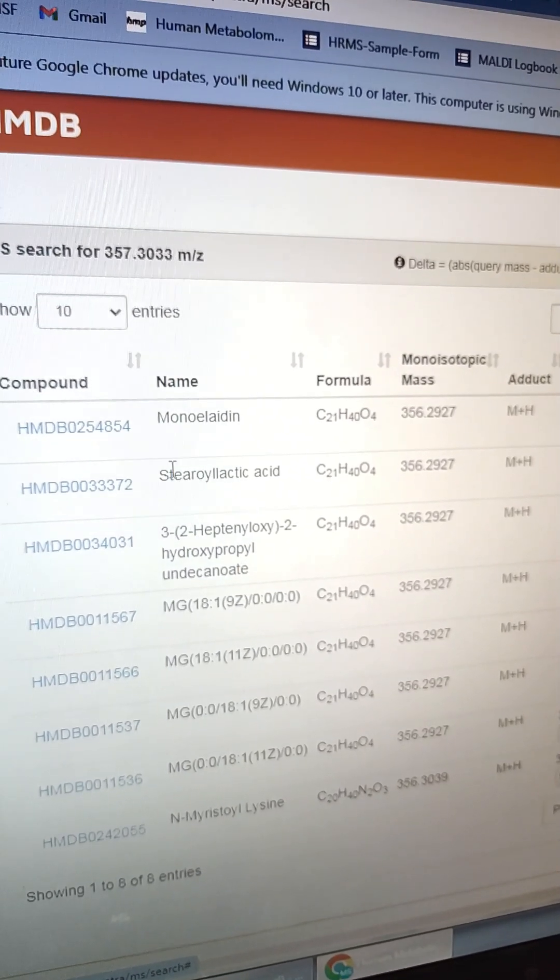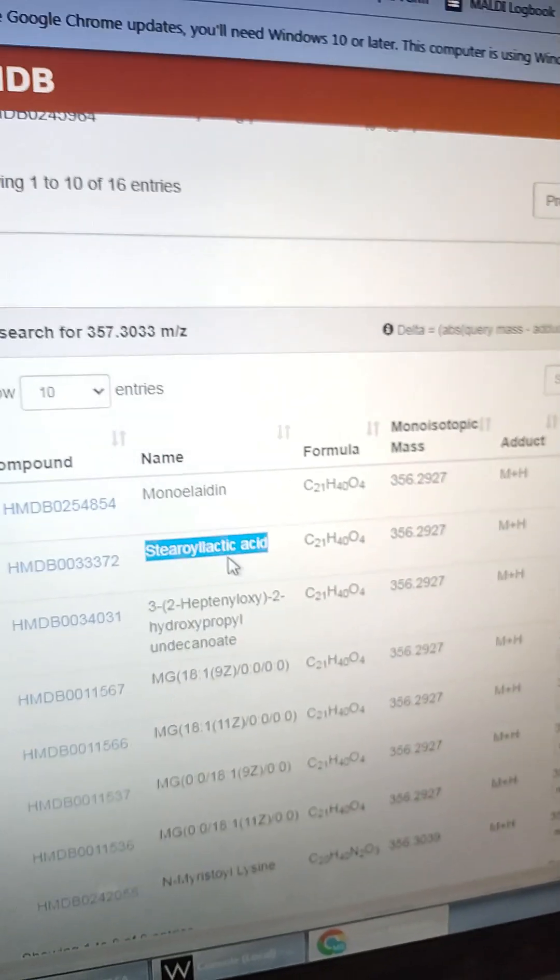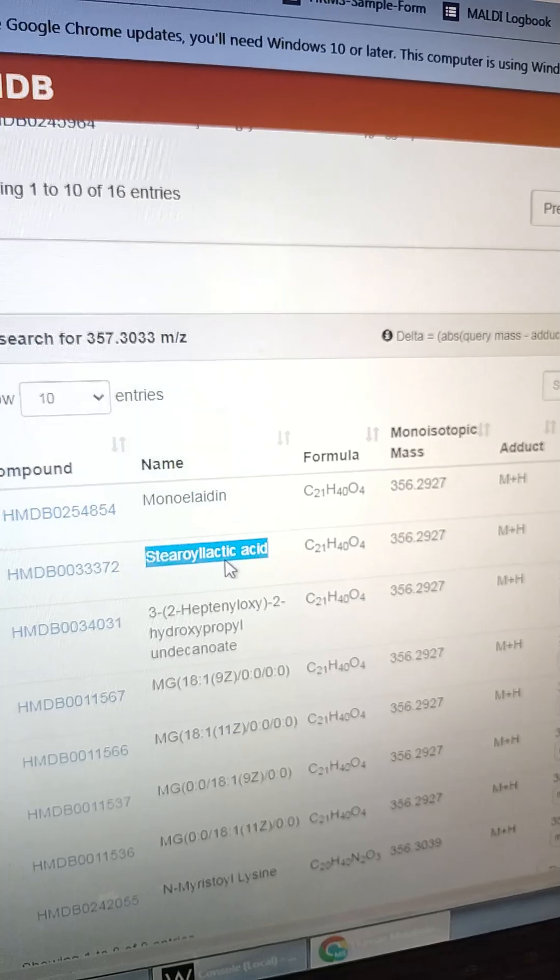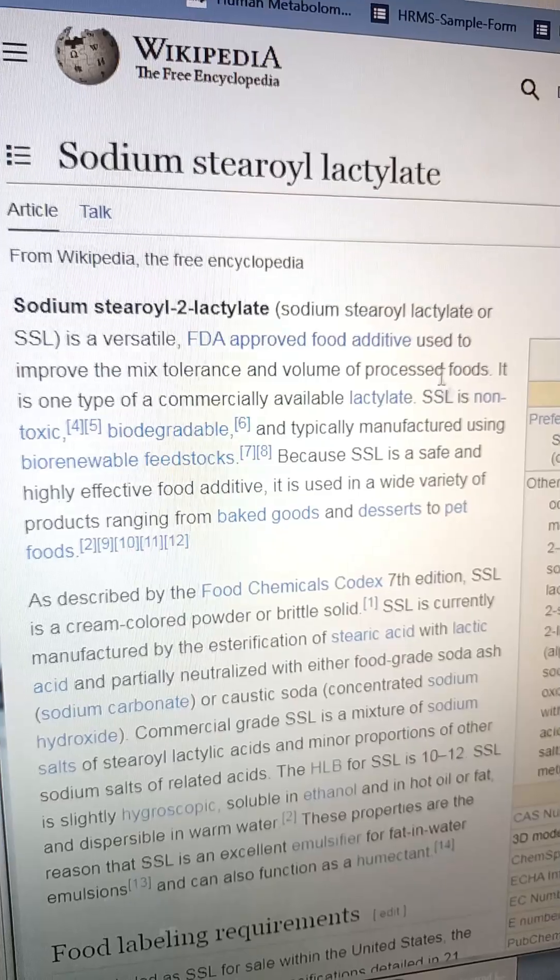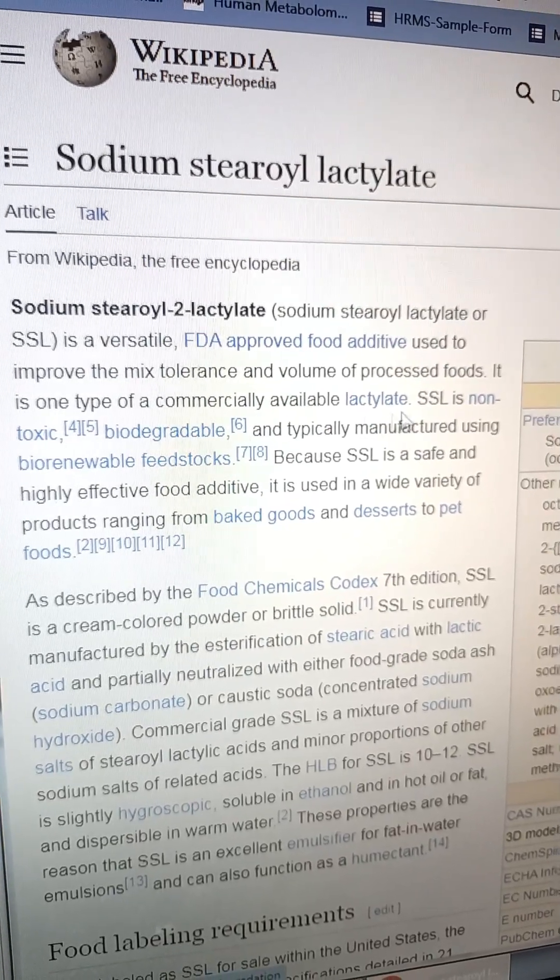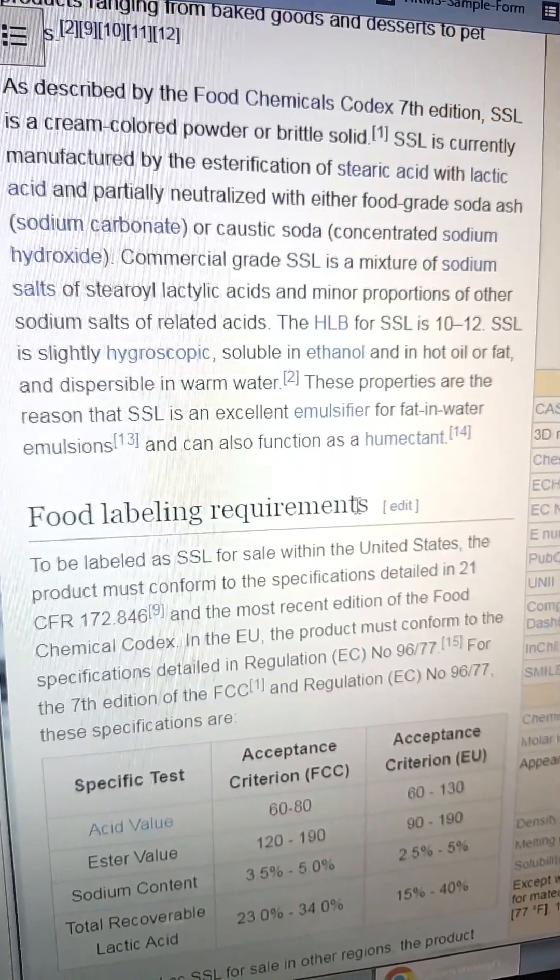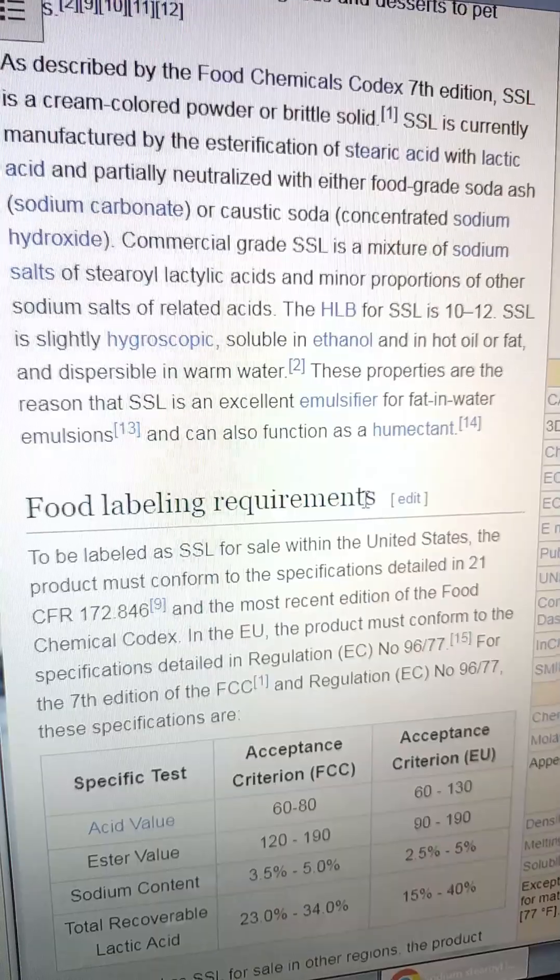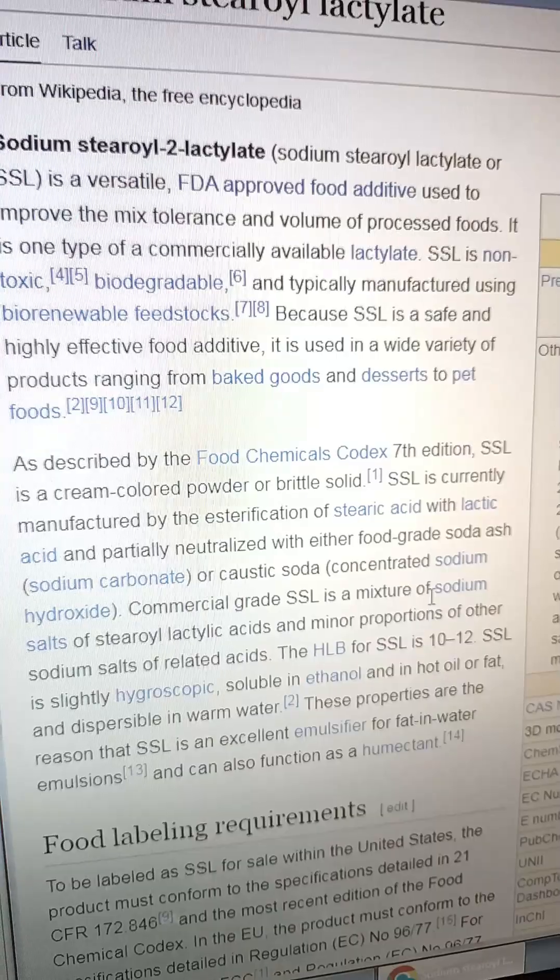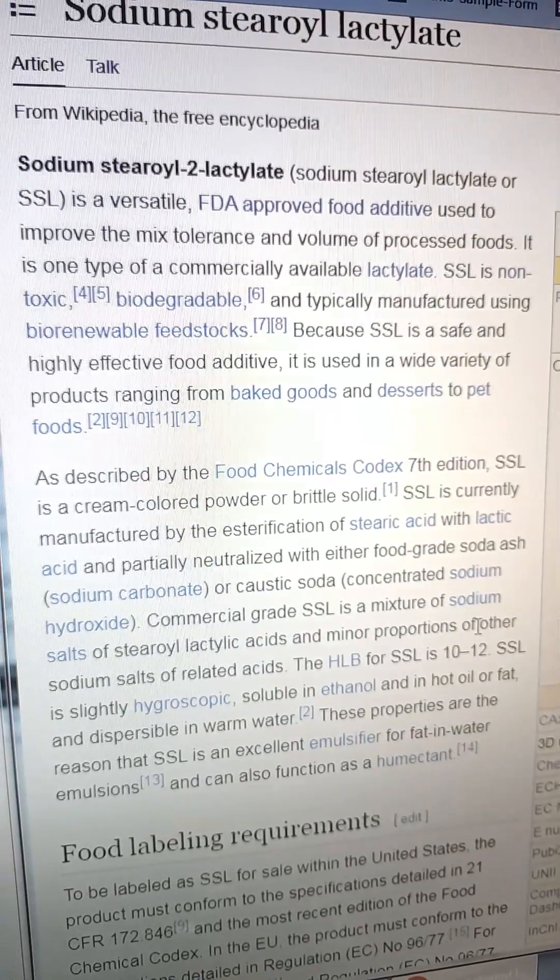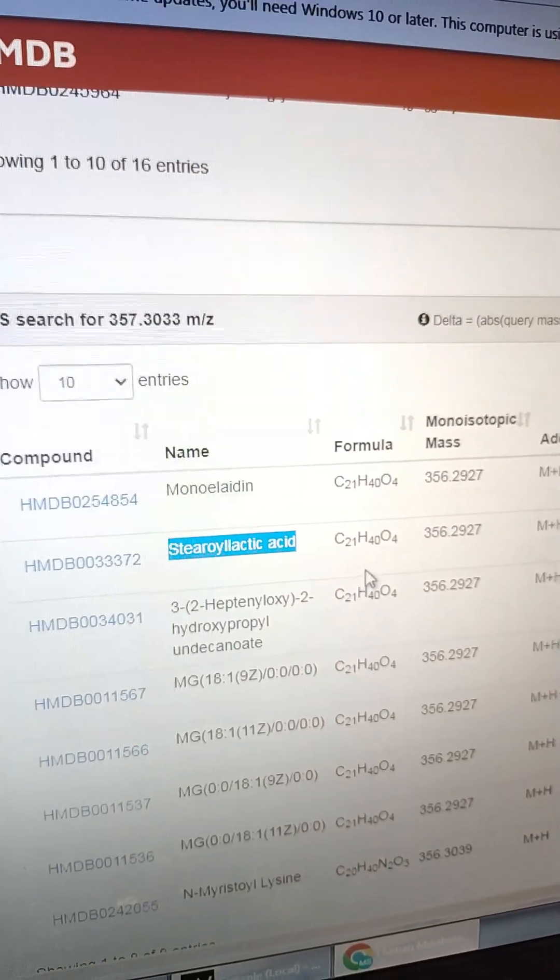So then 357, look who that is. That is the stearyl lactic acid, the SSL. That is that molecule I was talking about. SSL is food additive from the FDA. And it is used as kind of a flow agent, really common. I don't think you're required to label it. We'll use some MS-MS and confirm that that guy's there. But I'm pretty confident just from the hit here, that's what we got going on.